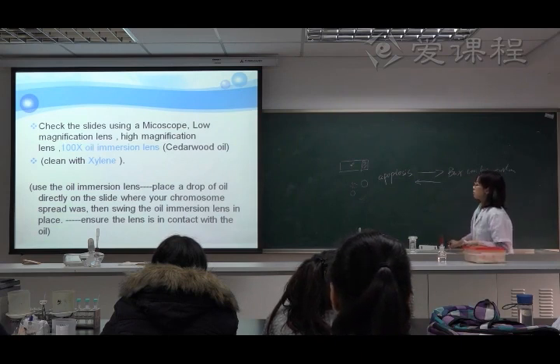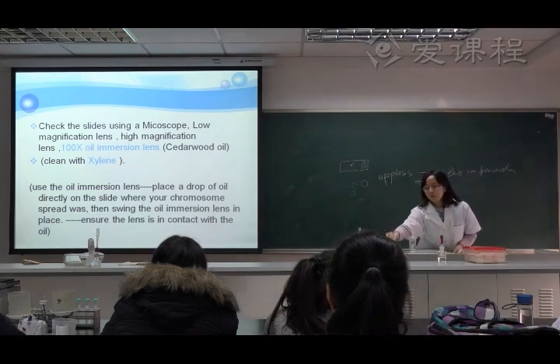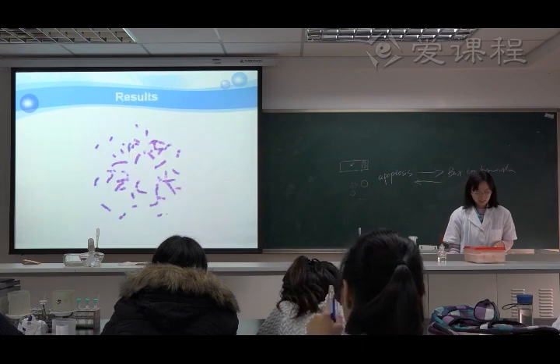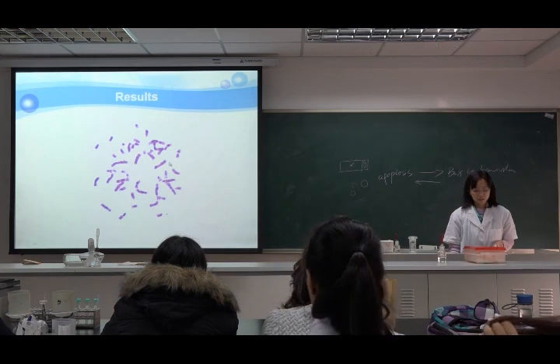After you observe, you should clean the lens. Maybe you can see here, this is a good result because you can see the clear dark and light bands on the chromosome. This is our result.